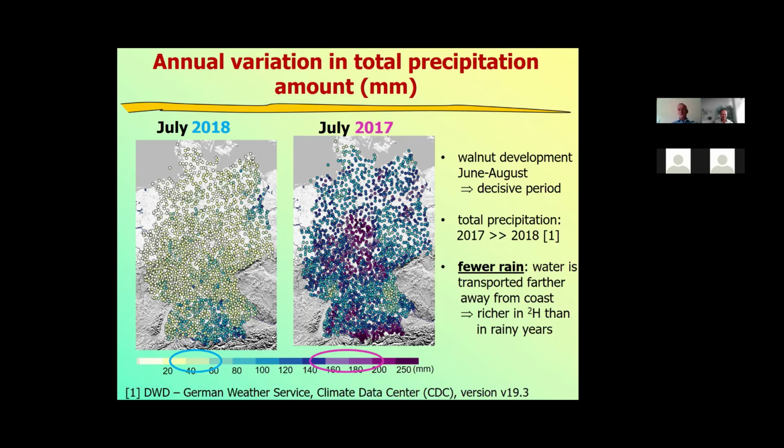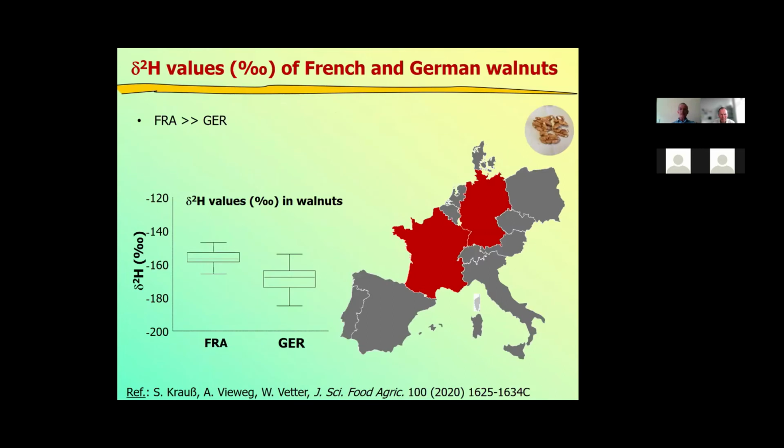And of course, the same is true for oxygen isotopes if you want to look at the water. So you cannot only use the data directly, but you must study what the environmental conditions are, because this, as I told you, is a physical fractionation, and therefore you need to know what is inside.